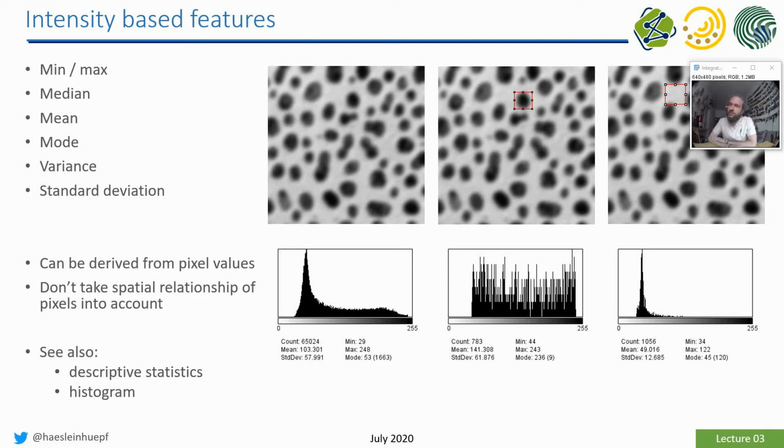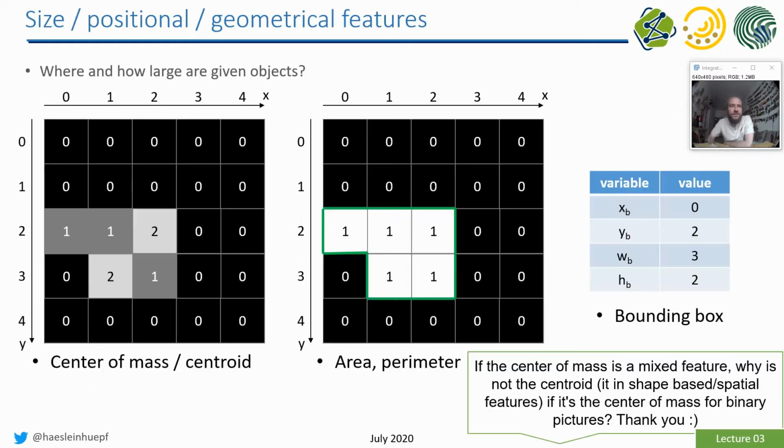We also had this in descriptive statistics a bit more in detail. You can do it on images, you can do it in regions in images, and if you're still not familiar with the histogram, I would maybe go through an image like that and move a box around while the live button in the histogram window is activated, and look at the histogram and the mean intensity and the min intensity, how it's changing, depending on where you put the ROI and what that means.